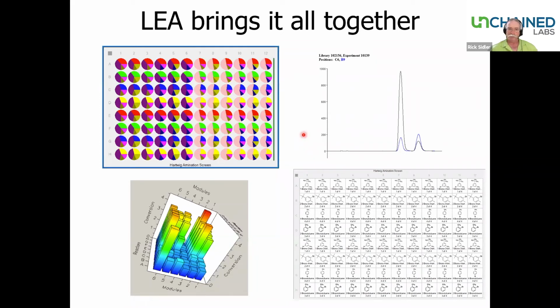We mentioned earlier on that we have to run these screening experiments with this discrete set of variables because we don't really have a good way at the moment to predict which ones are going to be successful and which ones are not. Hopefully that's in the process of changing.